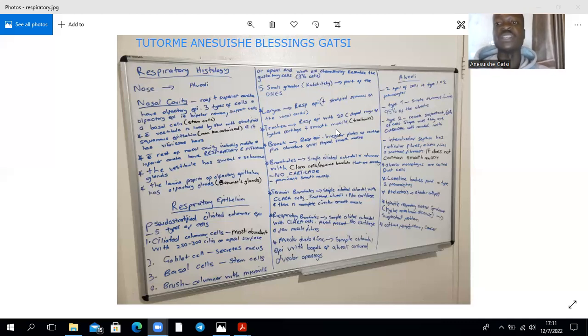Then you also have an adventitia, which is moderately dense connective tissue and is also continuous with the adjacent structures, to include the pulmonary vessels. Right. Then from the bronchi, you move to the bronchioles. The bronchioles have simple ciliated cuboidal epithelium, which has transitioned from the respiratory epithelium, which at some point you'd see as simple columnar, and ultimately the smaller bronchioles will have simple cuboidal epithelium.